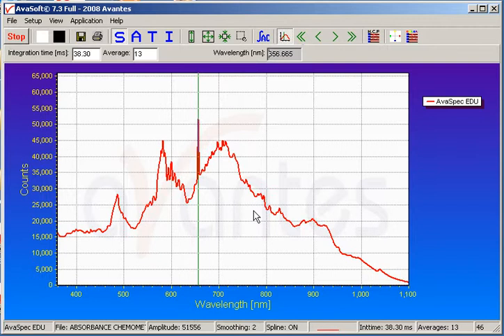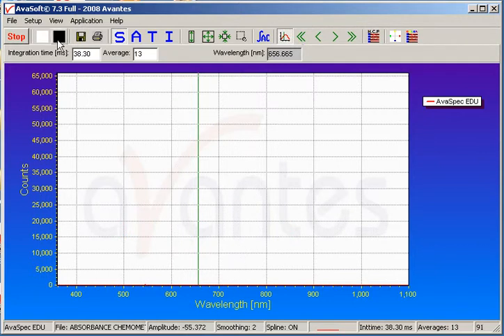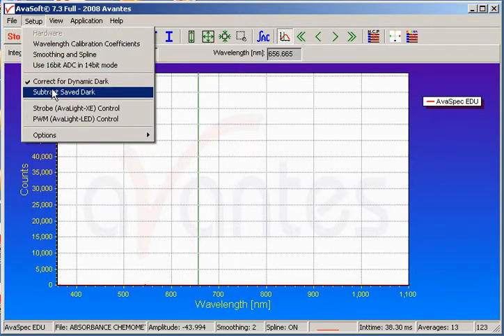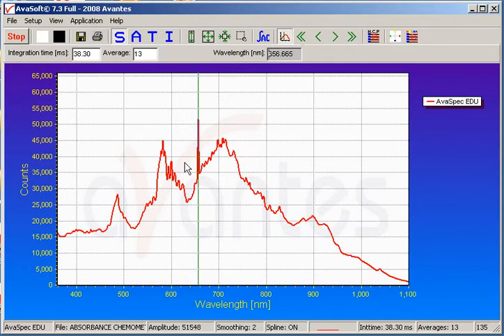These measurements are done with a cuvette containing water — our solvent — in the cell path. It is very important that you perform this measurement with your solvent in the path. Now we can take a reference of that solvent by clicking the white square and then clicking OK. Next, we turn off the light source to take a dark spectrum, allowing the spectral counts to drop to zero, then click the black square. Because this cell holder is open air, ambient light can influence the measurement, so we go to Setup and select Subtract Saved Dark to subtract out that dark signal.